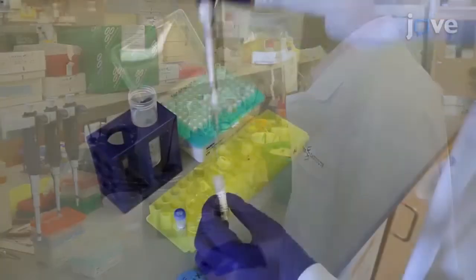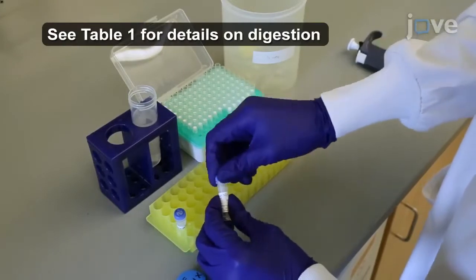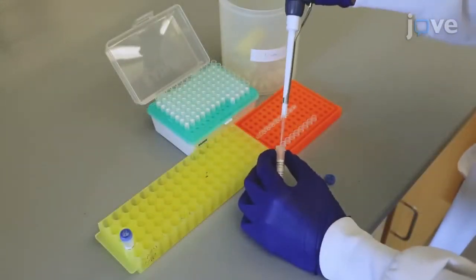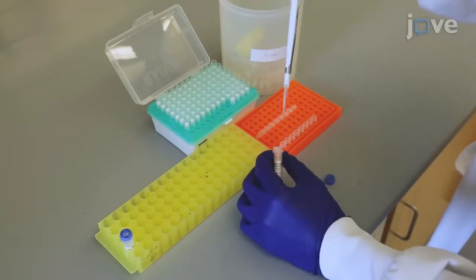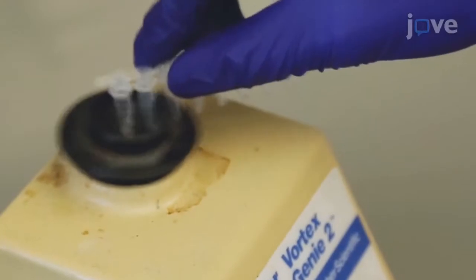To begin this protocol, dilute the lyophilized primers in one XTE buffer to a final concentration of 100 micromolar. Aliquot an equal amount of forward and reverse primers into PCR strip-capped tubes. Vortex to mix.